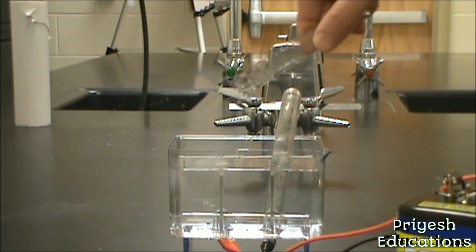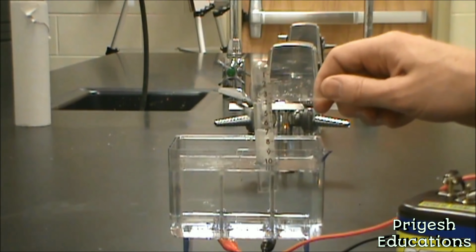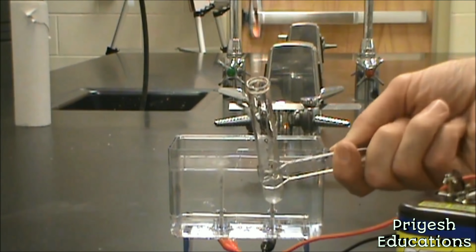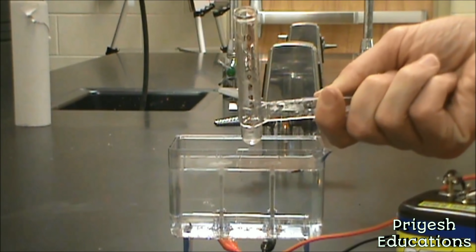So we are now just passing 5 milliliters of gas, actually just past 6. So we're going to do a second test with that. We're going to do the oxygen test. So we're going to grab this, put it upside down, and you can see that it easily ignites back into on fire, confirming the presence of oxygen.